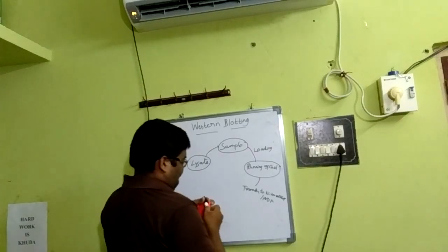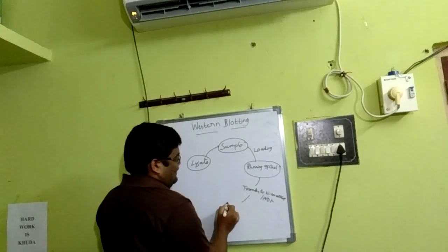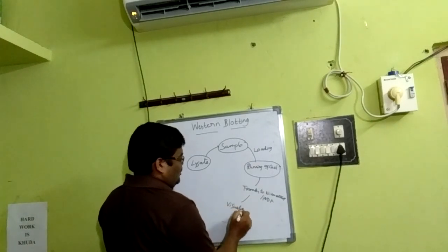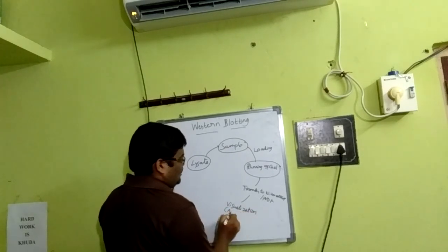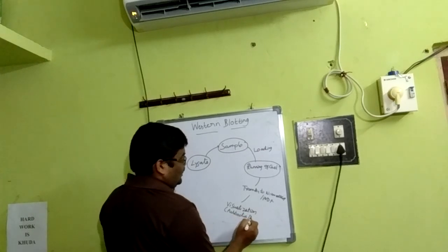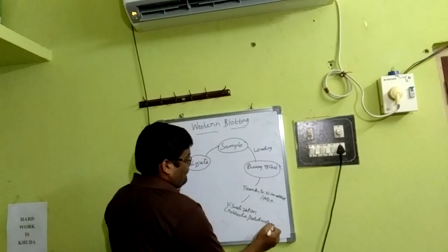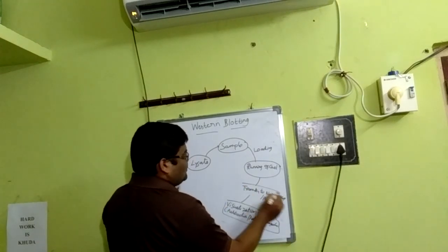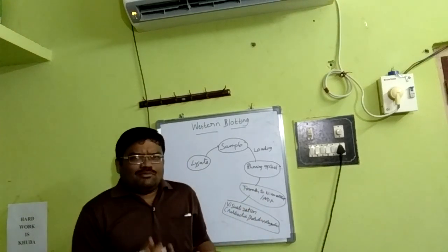Then visualization by particular antibodies and detective reagents. So it's about the basic protocol, how the Western blotting works.